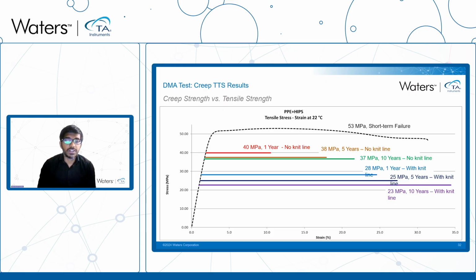If we look at 5 years performance, the material with no knit line can survive 38 megapascal, which is reduced to 25 megapascal for the material with knit line. And this allowable stress level the material can withstand reduces from 37 megapascal to only 23 megapascal for the material with knit line when we are looking at a 10-year period.